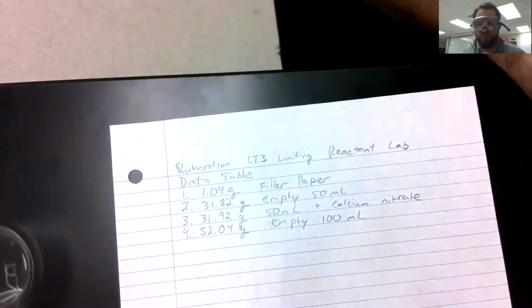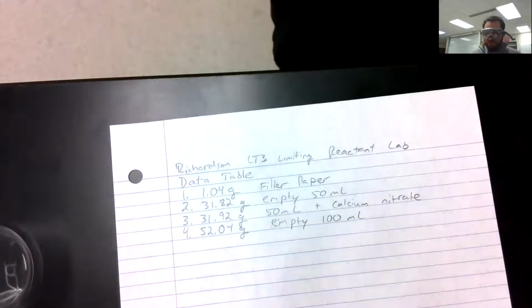Oh boy. Plus our calcium nitrate. And this last one here is our empty 100 mil beaker. So that might come in helpful for us later, so we know what all these numbers are. And now we're looking for our 5th data point.